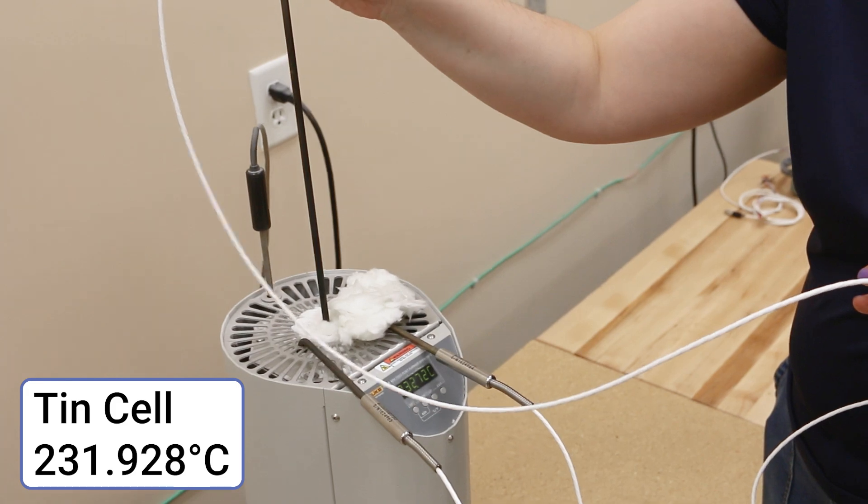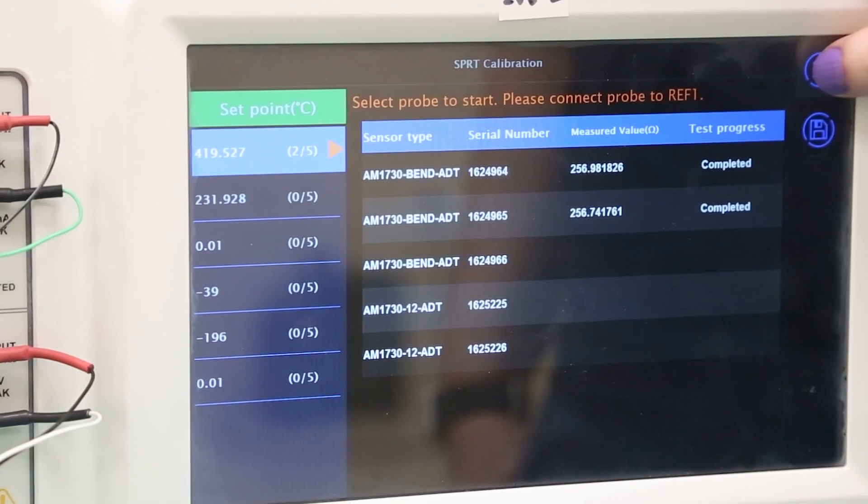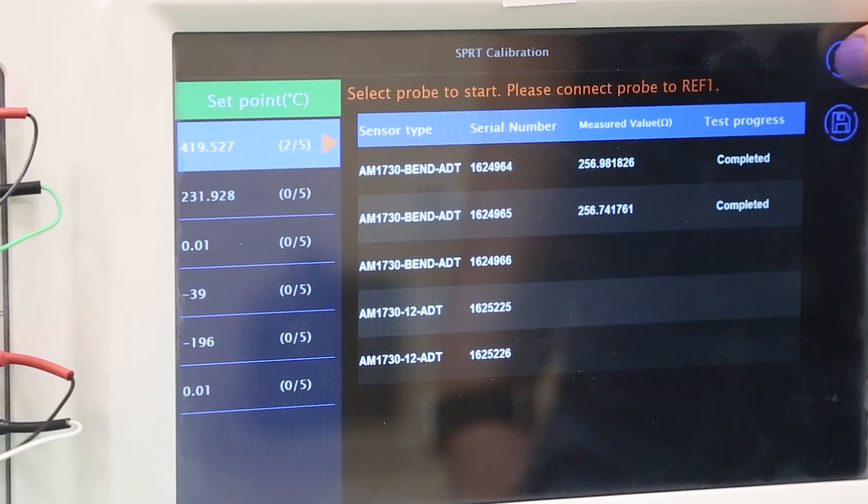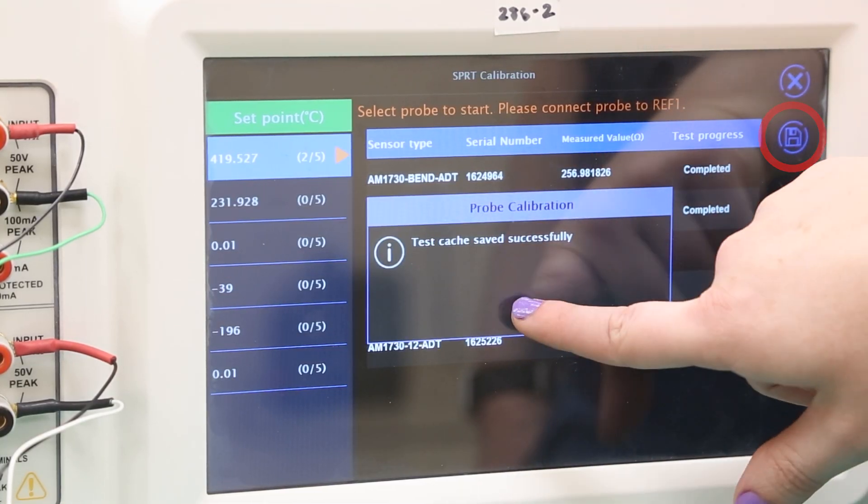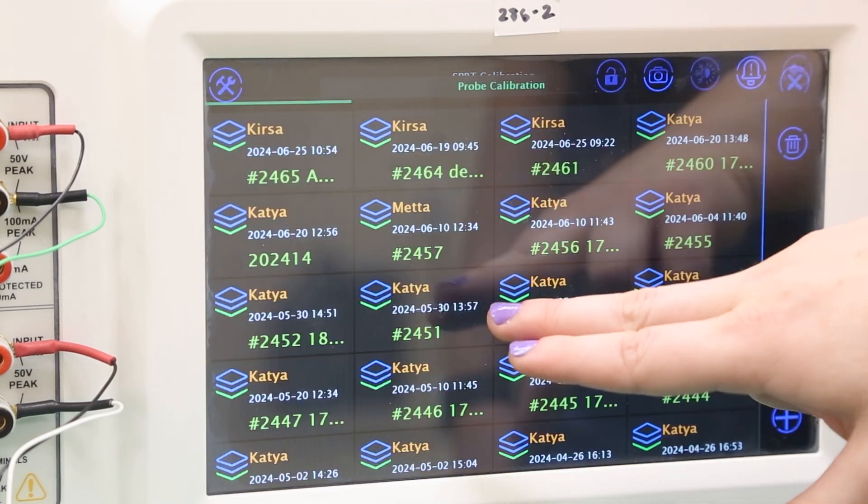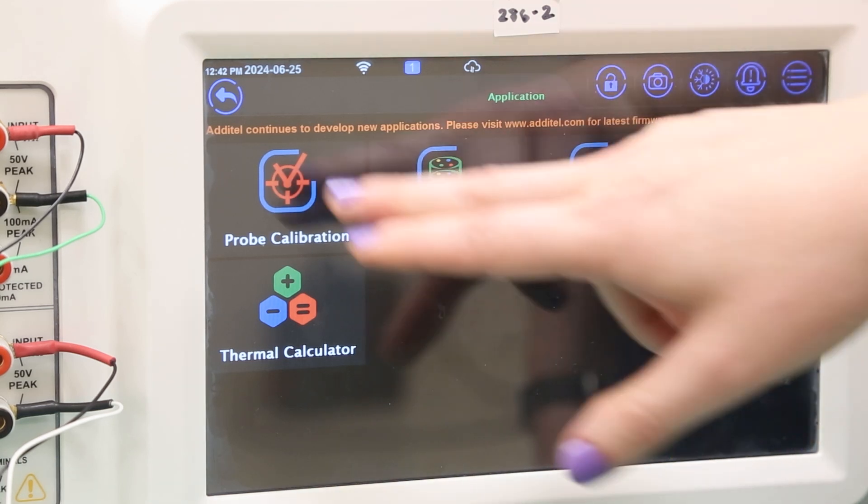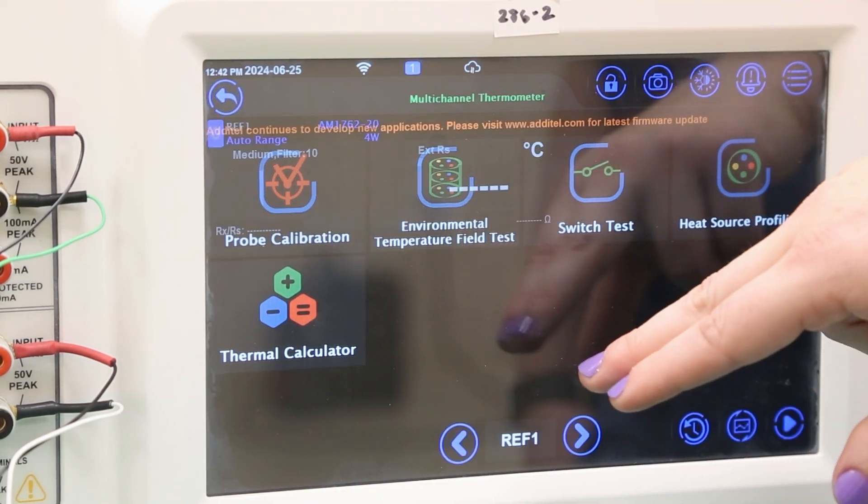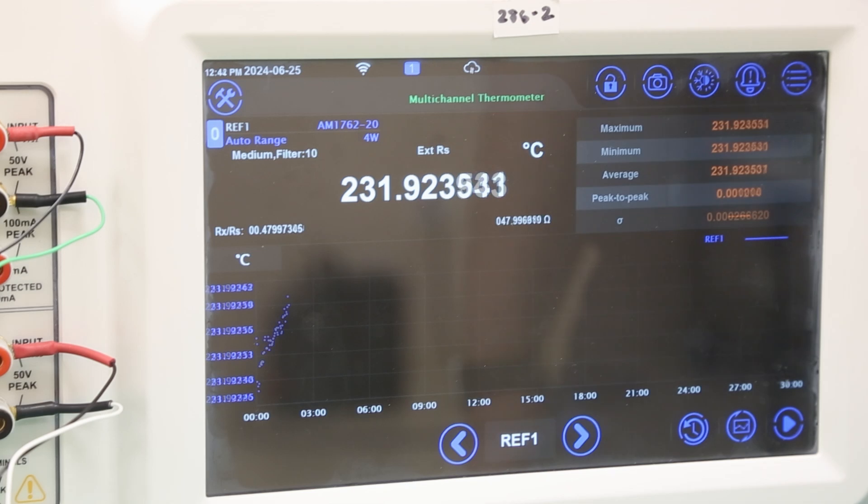One of the advantages of the fixed point program on the 286 is that any probe can be measured at any calibration point in any order. To do this, first save the test cache on the current calibration by pressing the save icon. You can now close the test and return to the multi-channel thermometer application. After inserting the reference thermometer into the tin cell, repeat the process of waiting for the temperature to stabilize by clearing statistics and checking the average and peak-to-peak values shown on the 286.